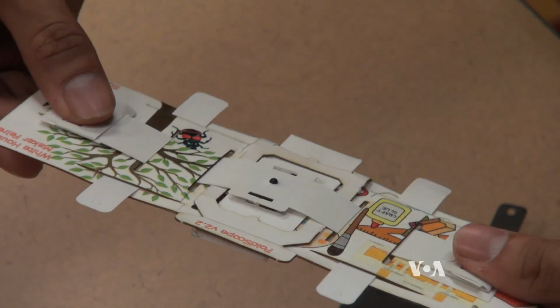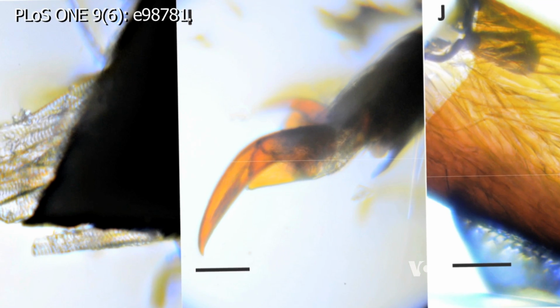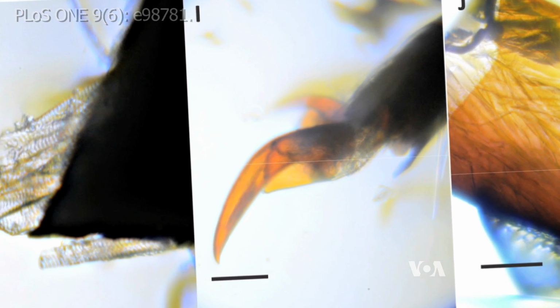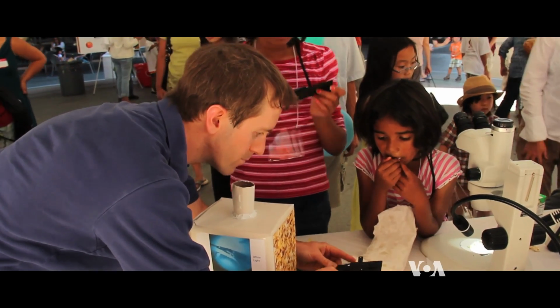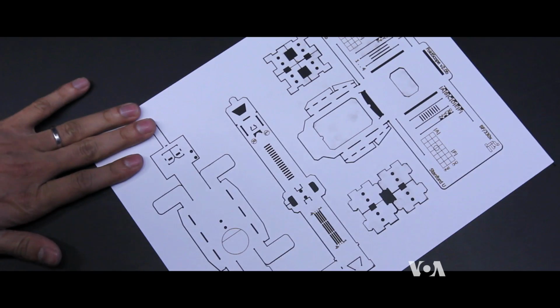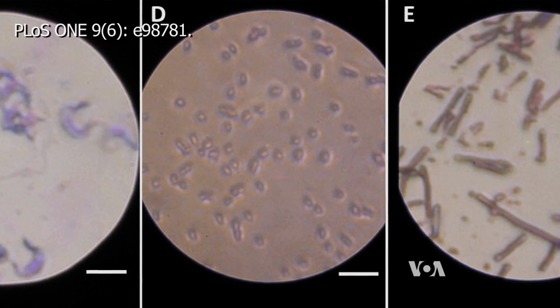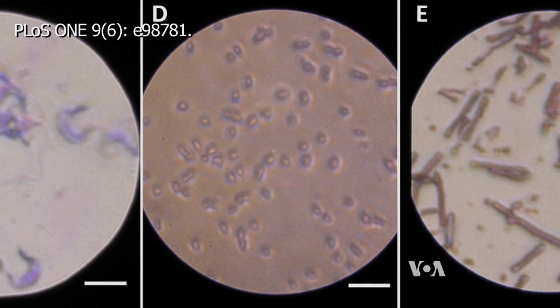The Foldscope is more than a toy. It's a powerful tool that can magnify objects more than 2,000-fold. Prakash and his colleagues are putting thousands of them in the hands of people around the world. The 10,000 Microscopes project is actually sending 11,000 Foldscopes to volunteers in 130 countries. There is a Mongolian farmer who's been very interested in camel milk, and he's been thinking about how does he really show his fellow farmers that if you don't treat milk properly, it could have pathogens in it. Pathogens like bacteria that would make people sick.